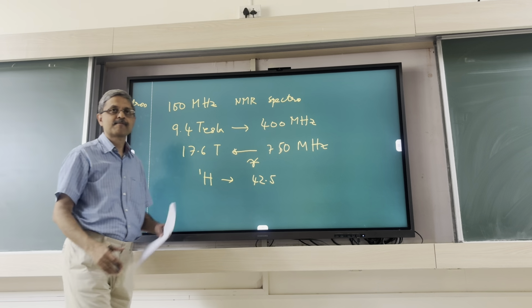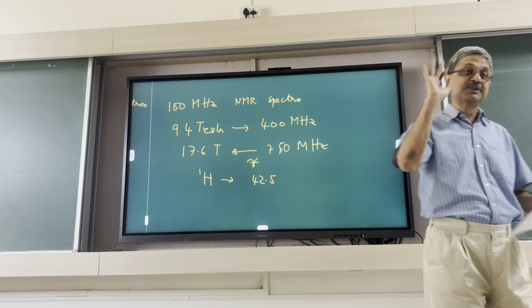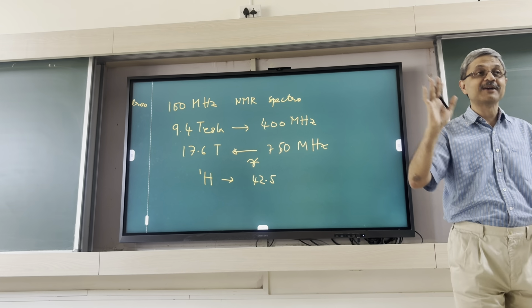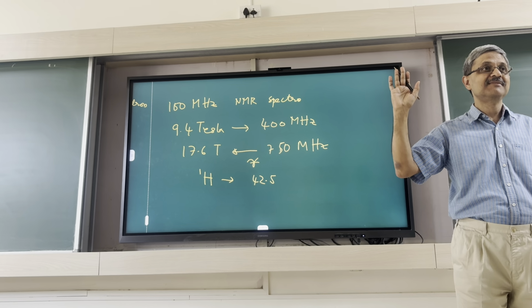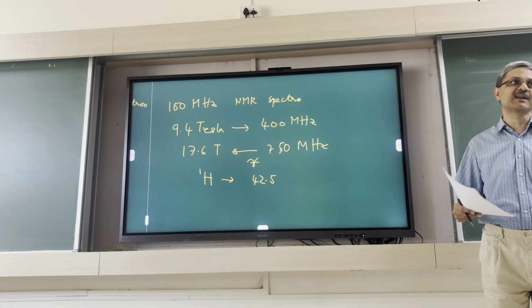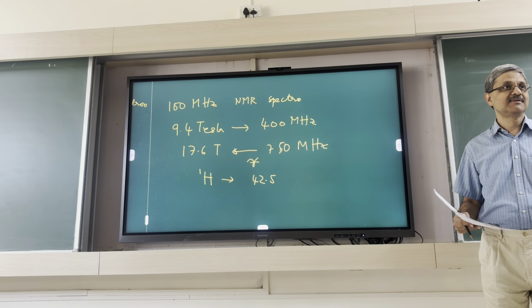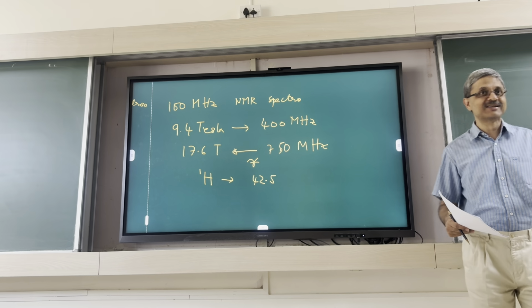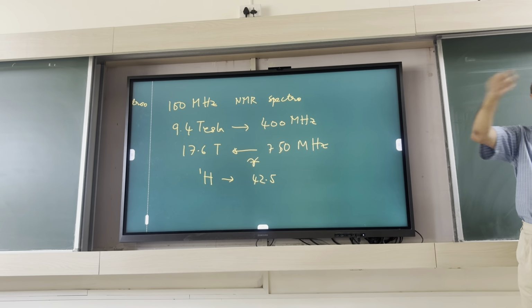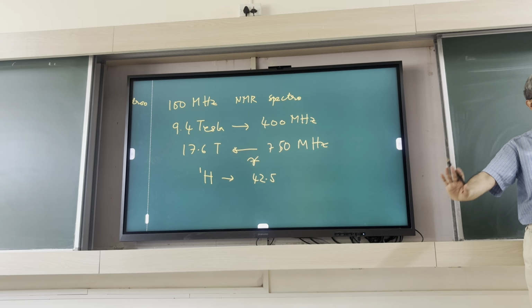But maybe they are not operated at the top. No, they are. It's fixed field. They are operated at the full field. Yes. And that's a separate topic. These are superconducting magnets, of course. Persistent magnets. So no power supply anymore. Current is circulating, and you just keep it cold enough. Keep it at 4.2 Kelvin.